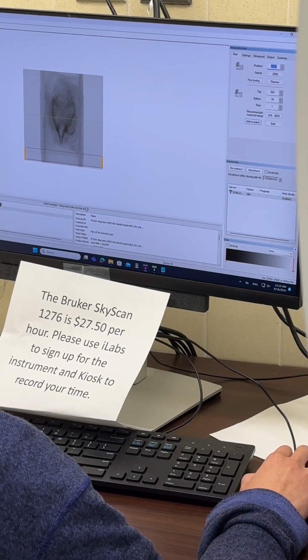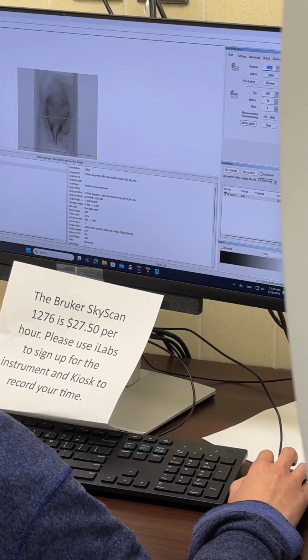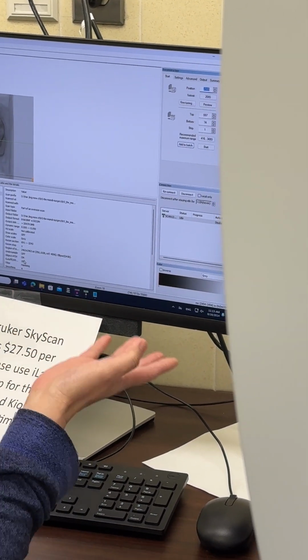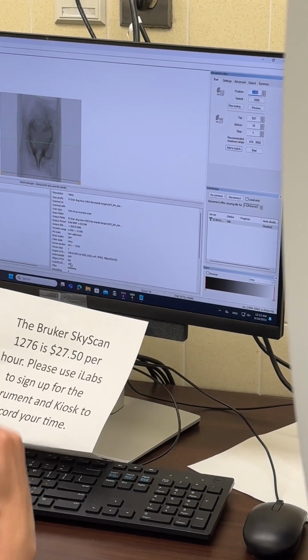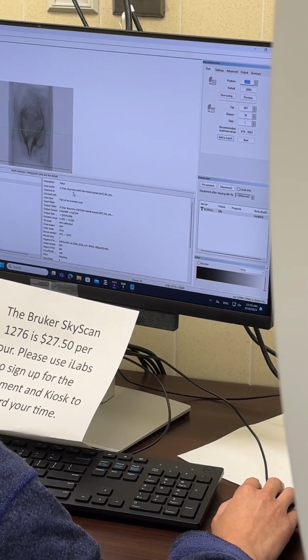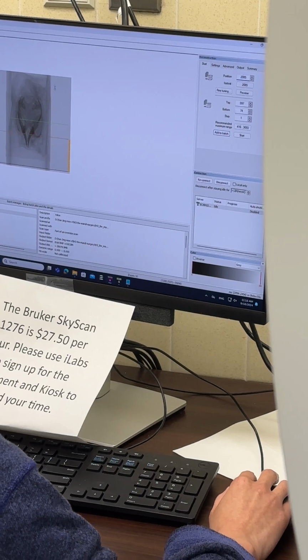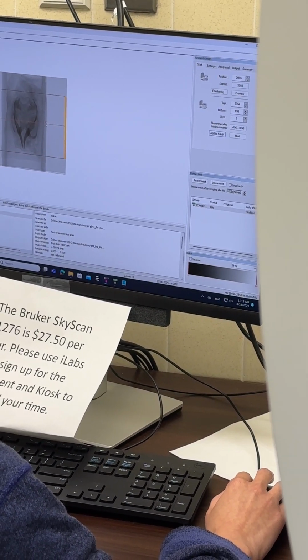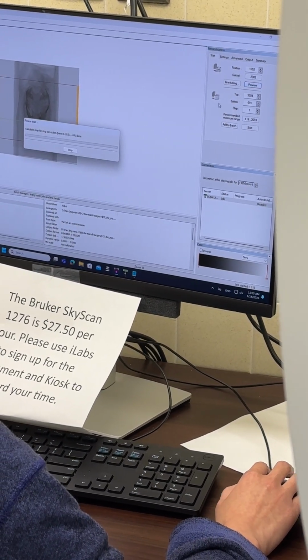And here, you may see this details, like the reconstruction setting here. I think there's some function in the software we can save it as a file, and next time you just apply it to every single sample of your project. Of course, you need to adjust the misalignment. This is the other group. I will set around first motor here and the preview.